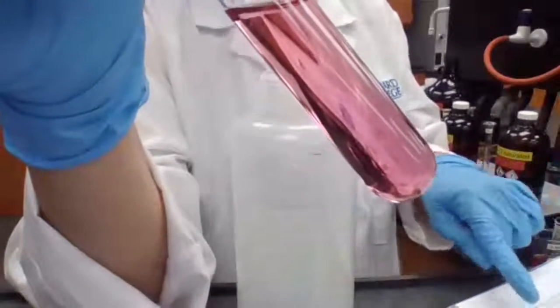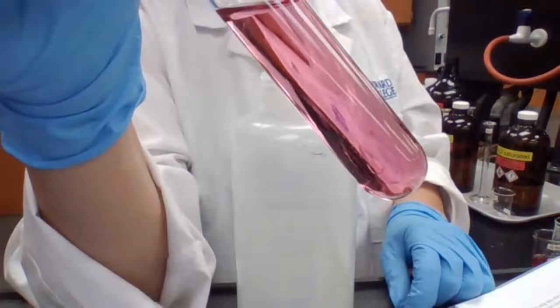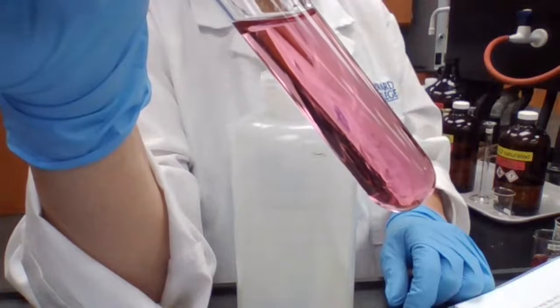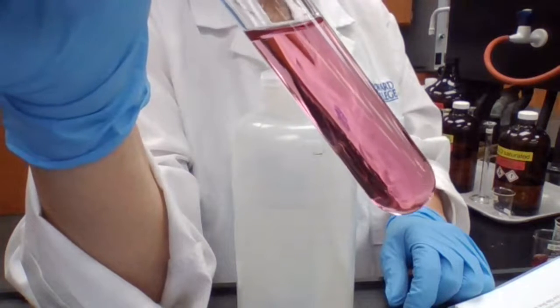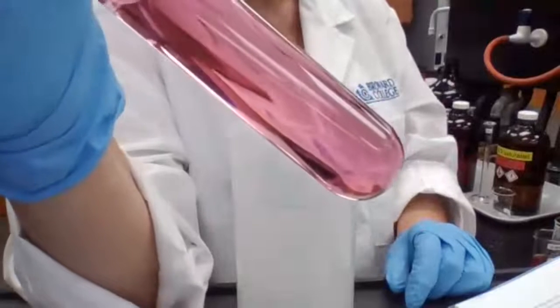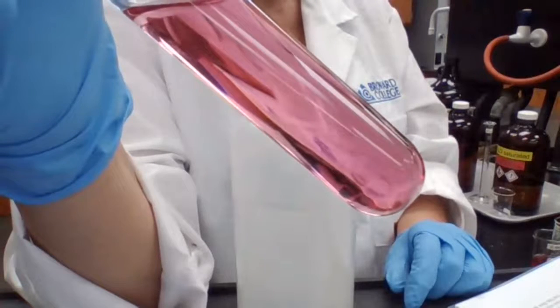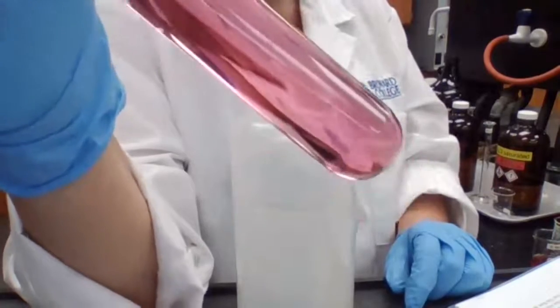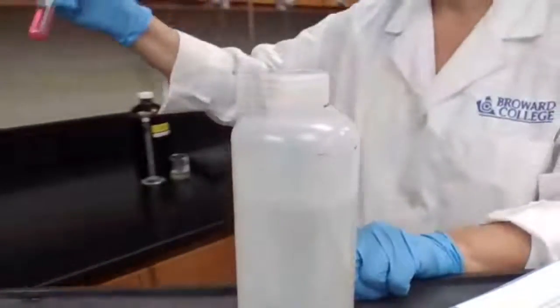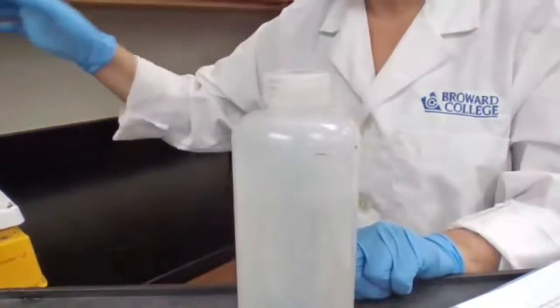Adding to test tube 1, we added water until no more color change. We saw that everything has changed to the original pink color that we had. It went back from blue. So we are going to place this solution now inside the hot water bath.